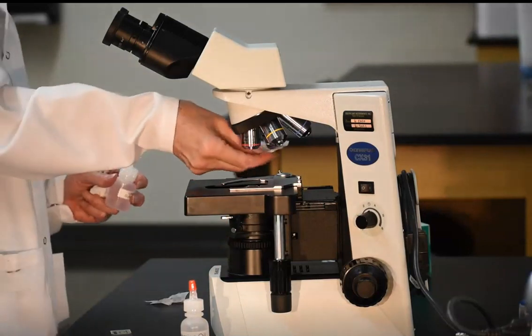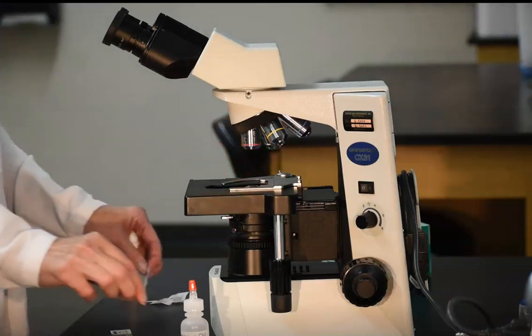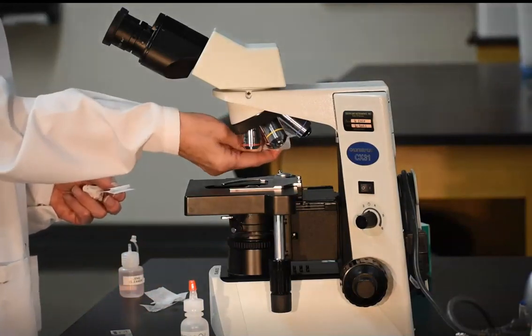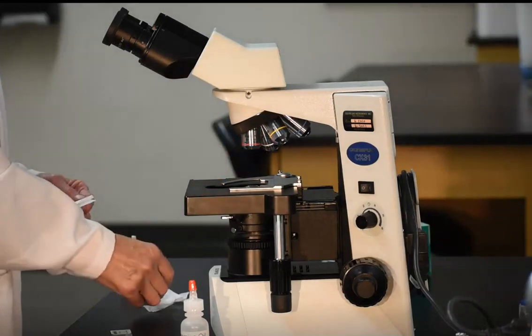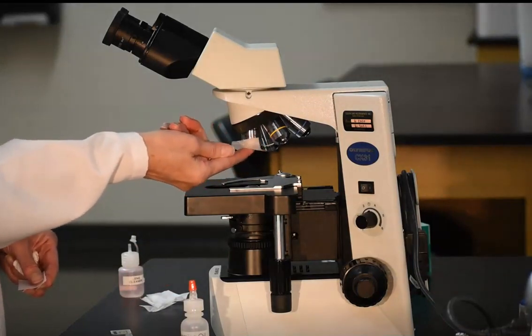Once the oil has been blotted, you'll use a fresh lens paper with a small amount of lens cleaner to clean that 100x lens. Of note, you don't want to use lens paper that has been used to blot oil on any other area of the scope. You'll just smear oil all over. Fresh lens papers should also be used to wipe the other lenses.